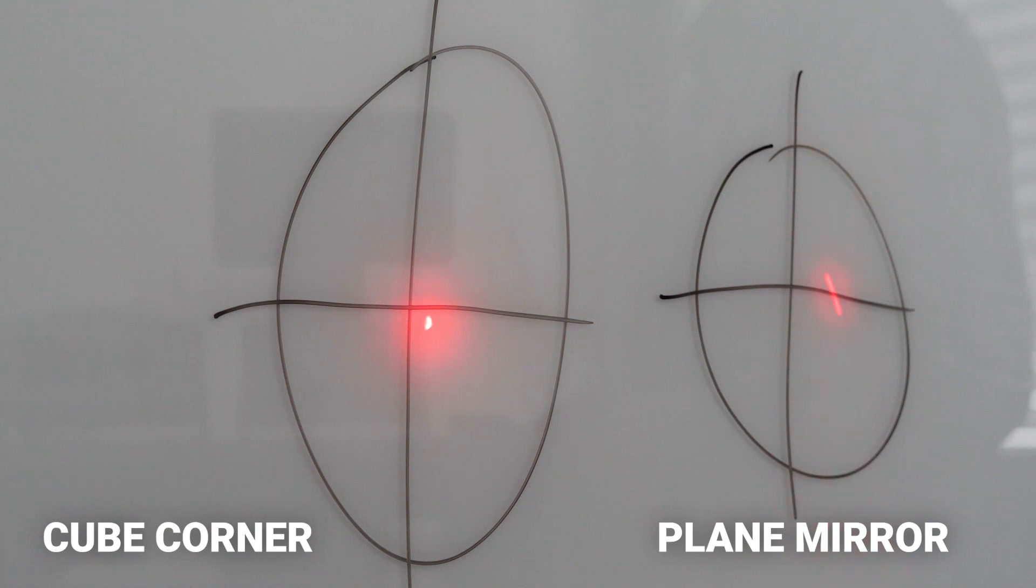In comparison, the cube corner dot stays right on target and the beam path stays perfectly aligned.